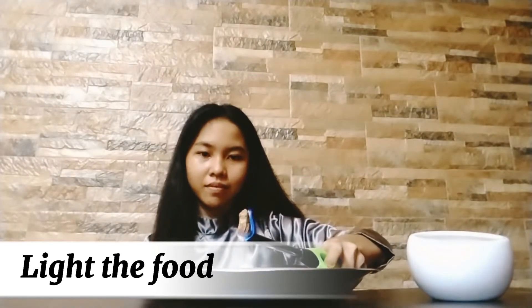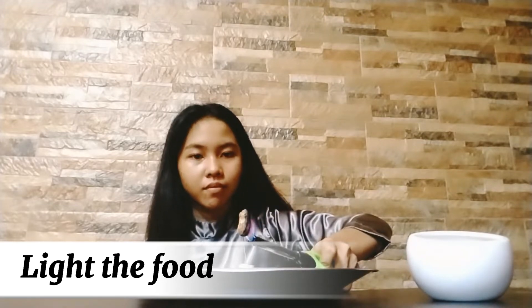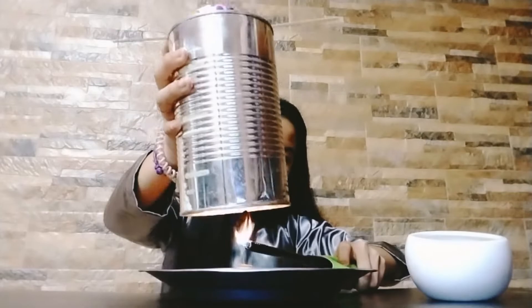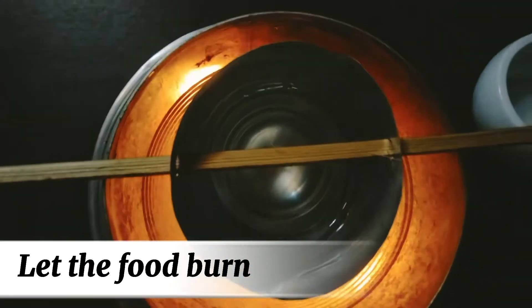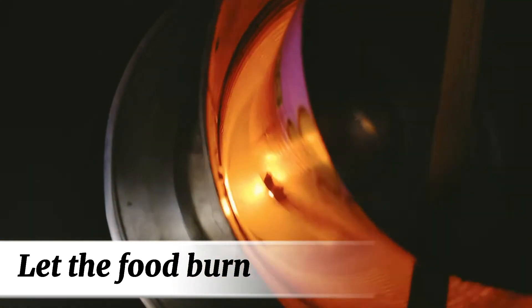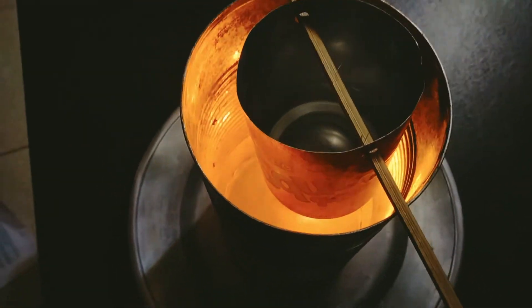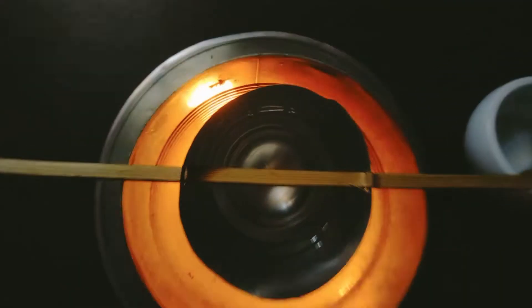Set the cork on a flat, non-flammable surface so that the food on the needle is sticking up. Light the food using a lighter, and as soon as it catches fire, place the can over it. Be very careful lighting the food and placing the can over it so that you don't burn yourself. Let the food burn — keep the cans over the food for as long as it takes to burn completely. As the food burns, it will heat the water in the small can that is suspended in the large can. Carefully watch the food as it burns; if it goes out before burning completely, relight it.